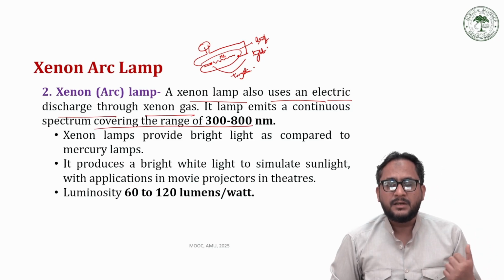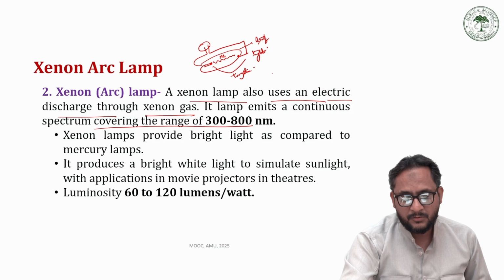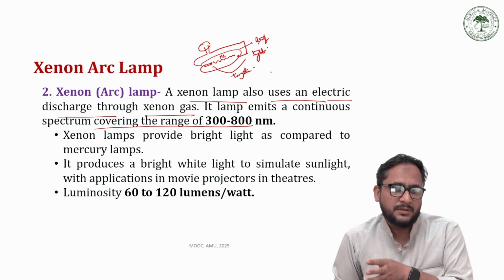As I said while discussing the light source in this schematic diagram showing the working principle of a spectrophotometer, in the case of UV we use a hydrogen lamp or deuterium lamp, and for visible light we use a tungsten filament lamp.